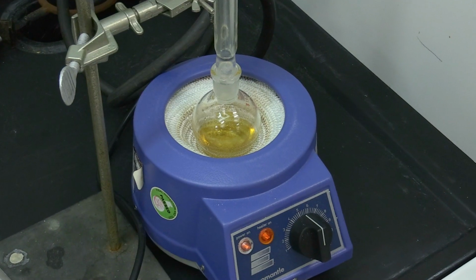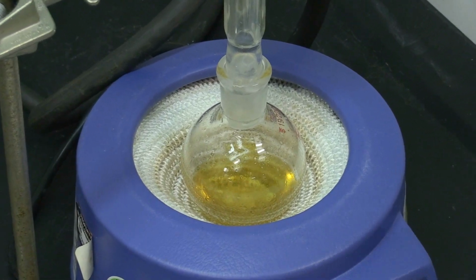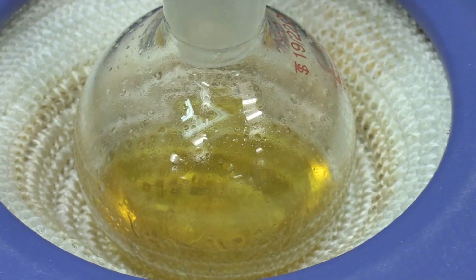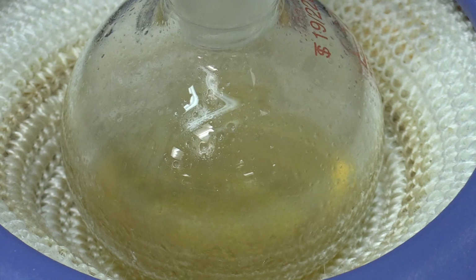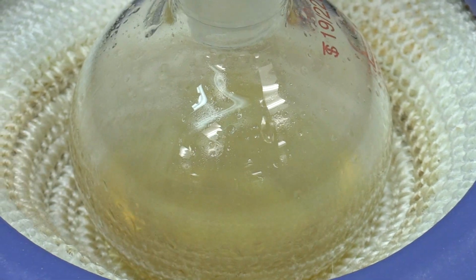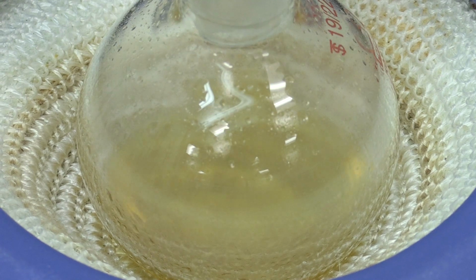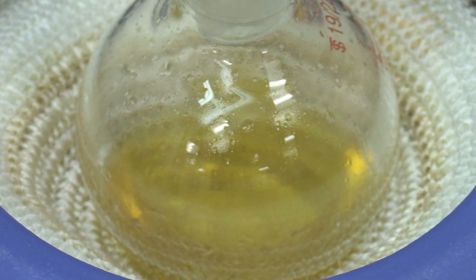This is part B of the experiment. Now it's undergoing reflux. As you can notice, the liquid is dropping back into the flask, so the reaction mixture is condensing in the tube and dripping back down. Now we simply just have to wait 60 minutes for the reaction to go to completion.